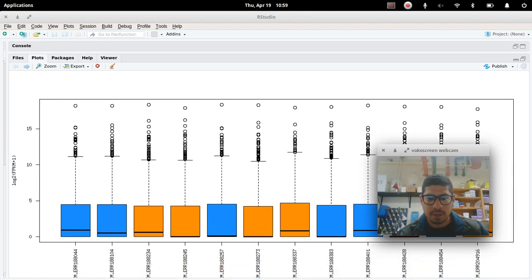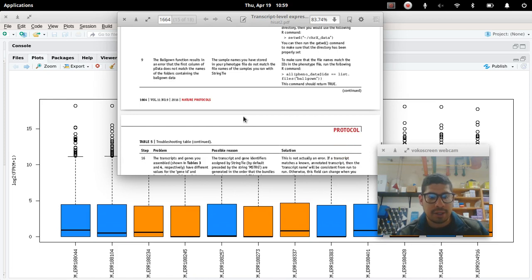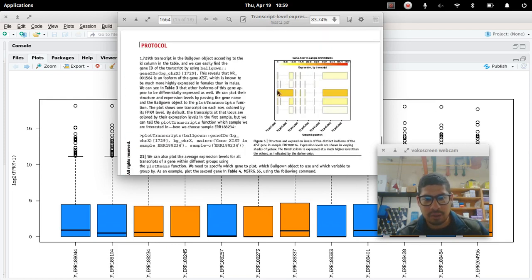And that concludes the R portion for this. Thank you very much for viewing this, and hopefully we can figure out next time how we can get something nice like these.